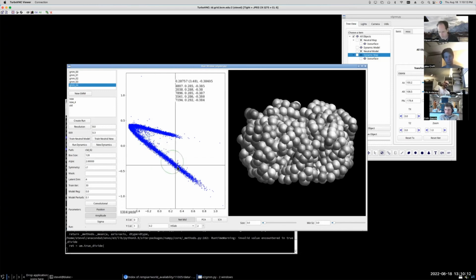Sorry, can I add just for posterity, because I don't know if you explicitly said it. For anyone watching the video, you get the e2gmm dynamic map view by middle clicking on the mouse, right, on the 3D. Yeah, over here, yes, I middle clicked on this to control which things I was seeing. And we'll probably add some buttons here to make that more convenient in the future. Like I said, it's a developmental program, but yeah, that's a good point.